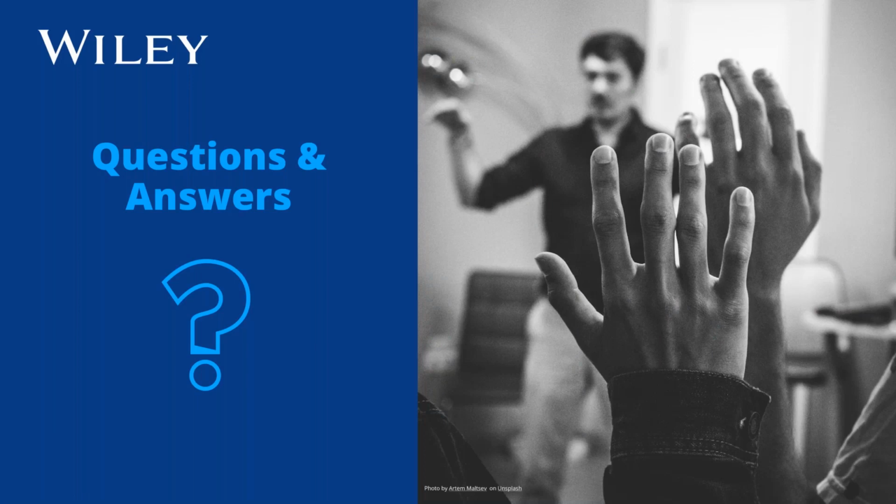Yes. Thank you, Michelle. Okay, how about this one? Can all brand GC data be processed in this software? Is it a standalone software? It is a standalone software, but we read in multiple file formats. We just calculated, I think we have 130 different file formats you can put in. And for GC data, you can always put in XY format. With GC you can even have multiple components. Actually, you can use an internal standard to calculate the ratio of quantitation for GC components.